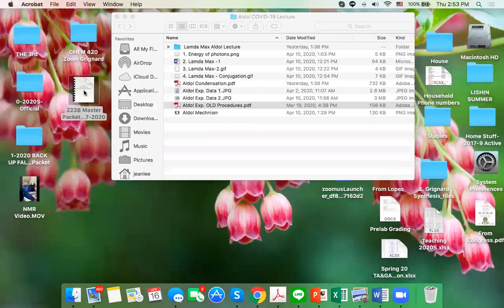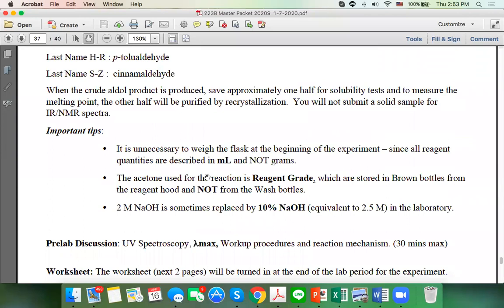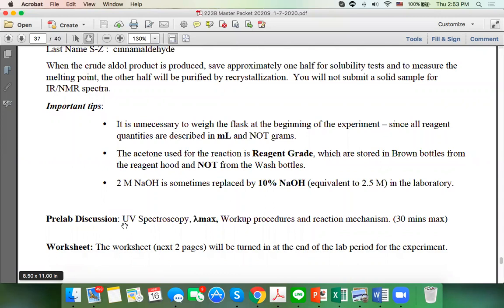right here, did I tell you I want to show you there is a special property about this molecule you're synthesizing? And we want to study it using spectroscopic, the UV spectrometer. We want to run the test to characterize your end product by dissolving it into a solution. Then we can run this molecule in the UV spectrometer and study the absorbing behavior. How this molecule will absorb UV light. This will be studied for your end product.